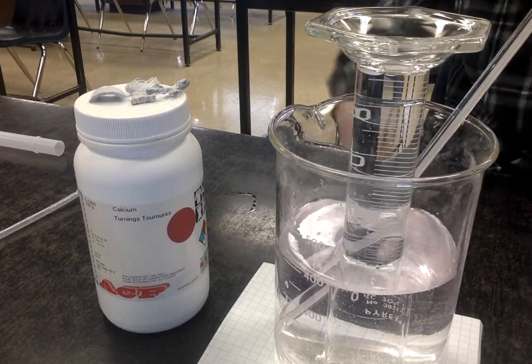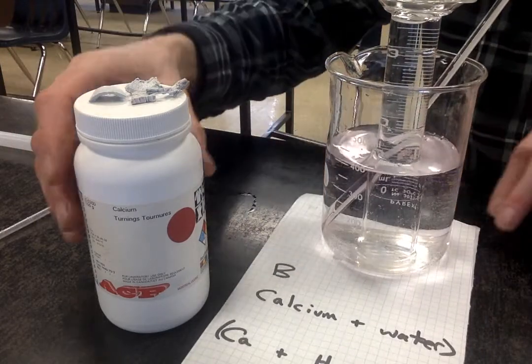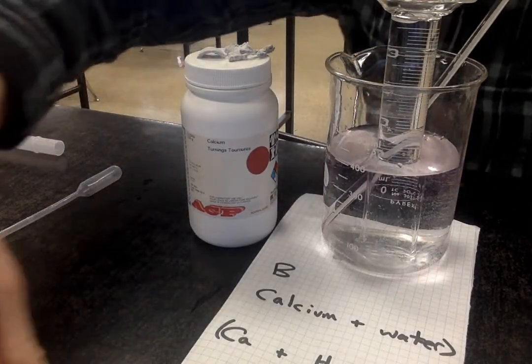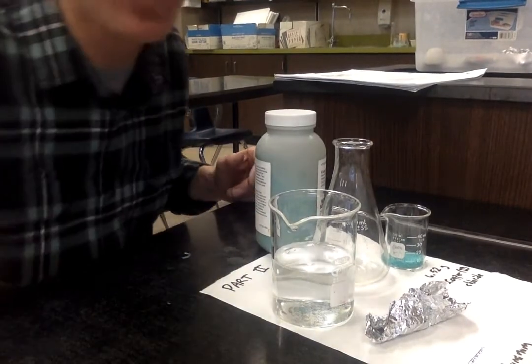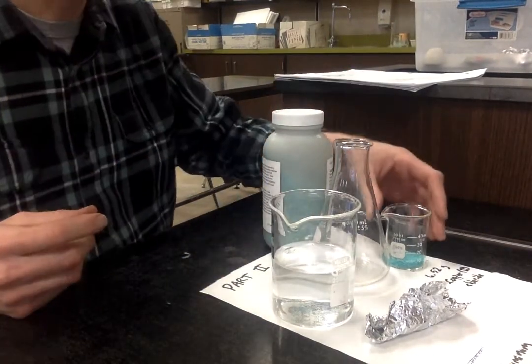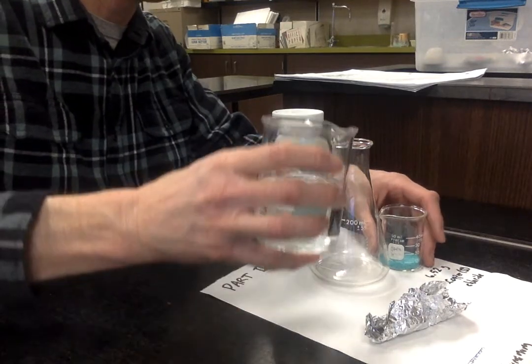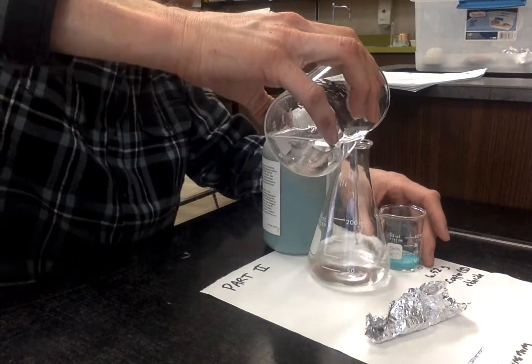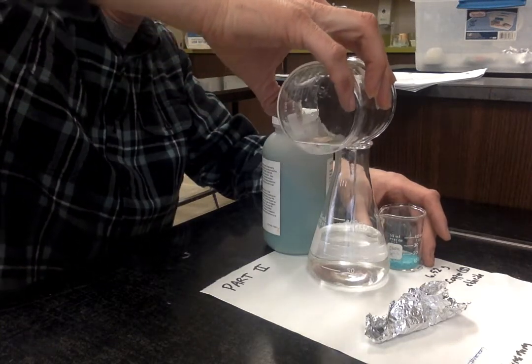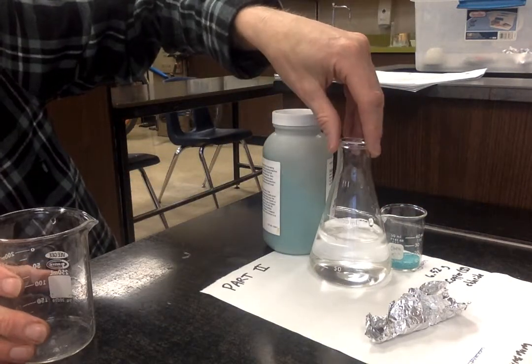While the temperatures are stabilizing, I'm just going to shift this backwards so we have lots of space. I'm going to shift also the camera so it's viewing what happens over here. This is the copper chloride and aluminum reaction that I'm getting ready for here. Here is my 150 milliliters of water. You want to add the solvent, the thing that will do the dissolving, first into the Erlenmeyer flask. There we are, 150 milliliters of water, about.